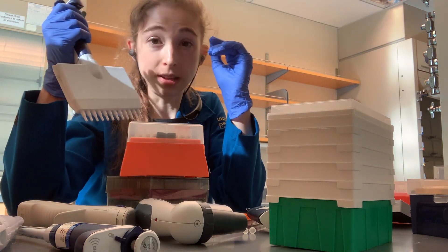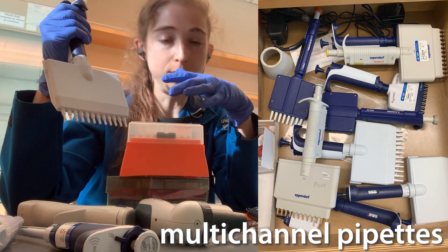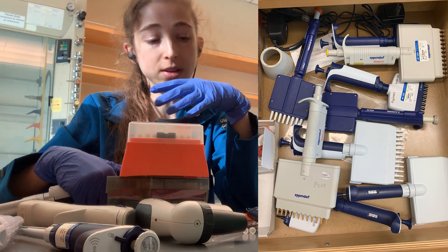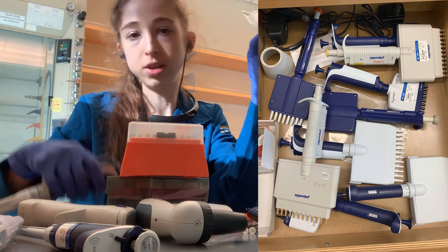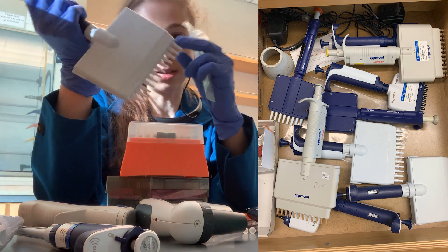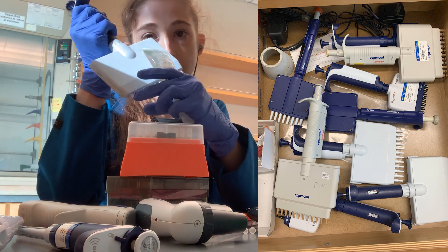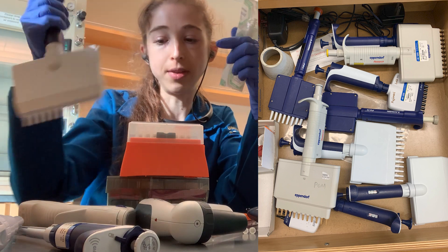For multi-channel pipettes, not all tips are going to work with them — multi-channels are more picky about which ones they work with. So make sure you're getting and using the right ones with your multi-channel. Multi-channels come in different sizes just like the others, but they just have more tips — a whole row — so you can do more wells at once.